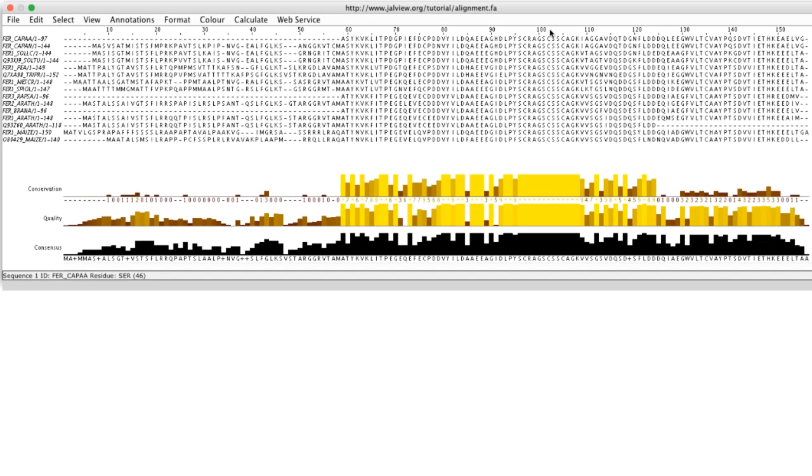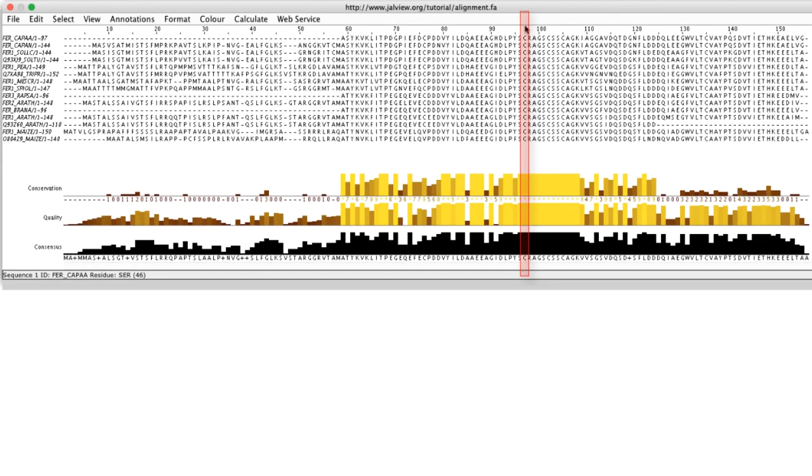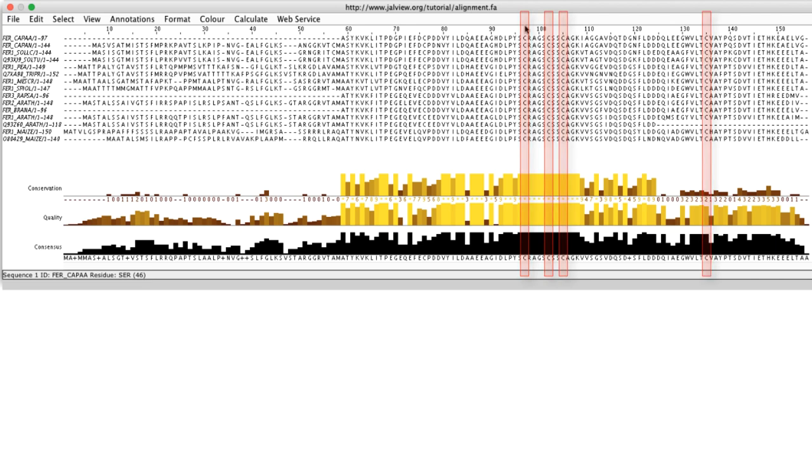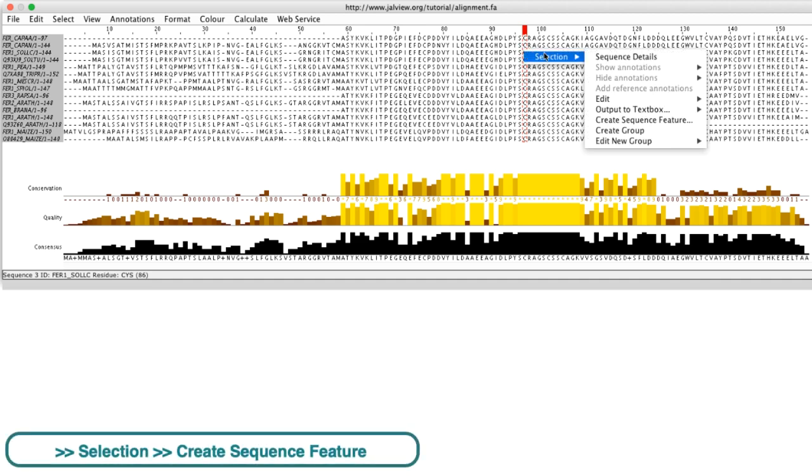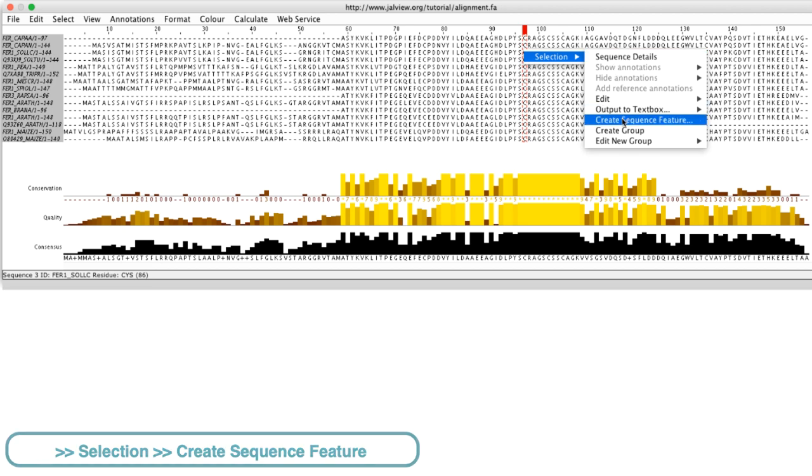The cysteine residues at column 97, 102, 105 and 135 are all involved in iron binding. If I navigate to column 97, select the entire row by clicking on the ruler bar and right-click on the column to open the context menu.